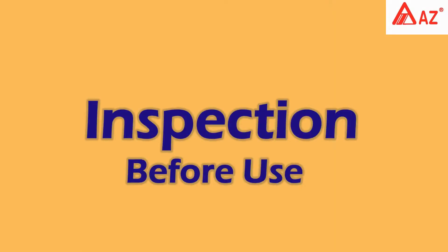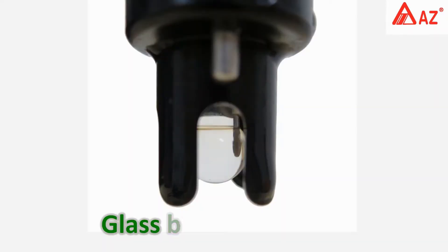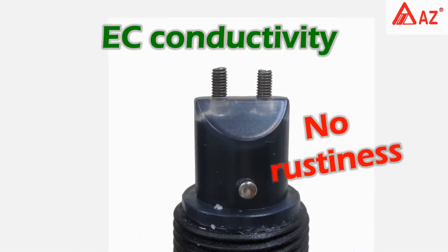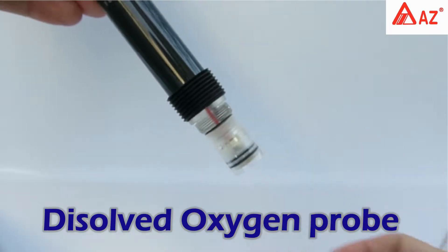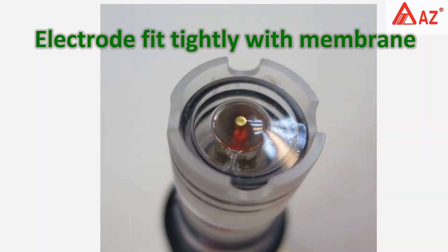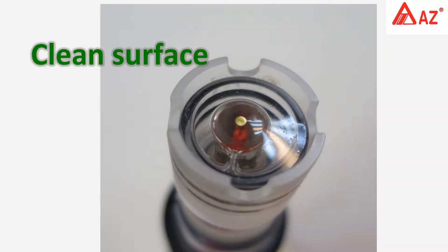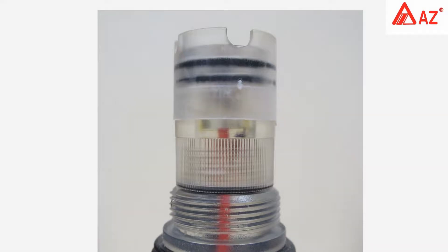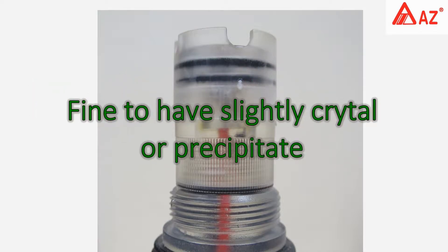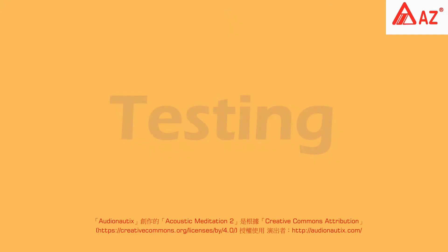Inspection before use: keep the pH probe in its protective cap and moisture glass. The bulb should be in great condition. Check the EC conductivity electrode and dissolved oxygen probe — remove the anti-collision hood, ensure no broken electrode, membrane fits tightly and is clean. Electrolyte should be above half height; slight soft crystals or precipitate are acceptable. Screw on the protection hood after inspection.